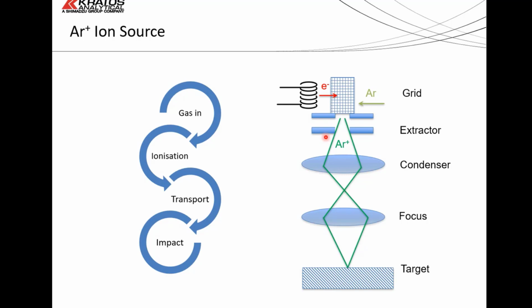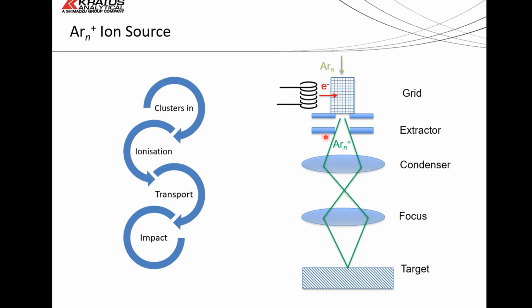So it can give you, depending on the instrument and your configuration, an argon ion target from like 100 microns to even up to a millimeter in the XPS world. Though in the SIMS world, it might be much smaller. In other worlds, it can get up to the size of centimeters. So that's the basic architecture that you'll find in most commercially available ion guns.